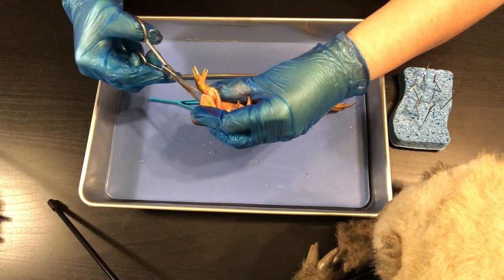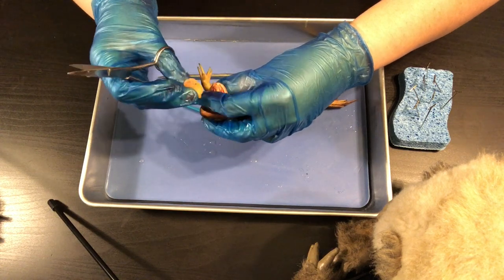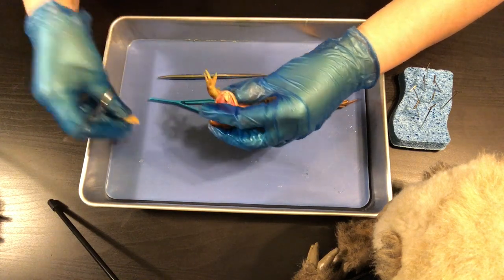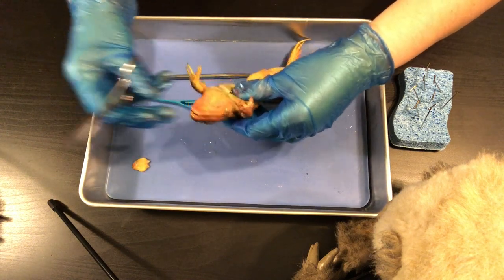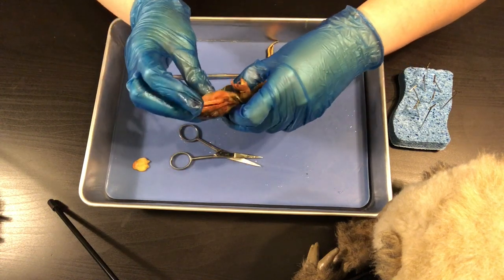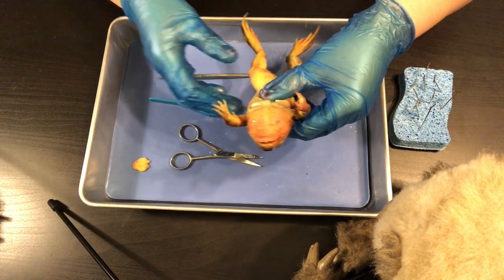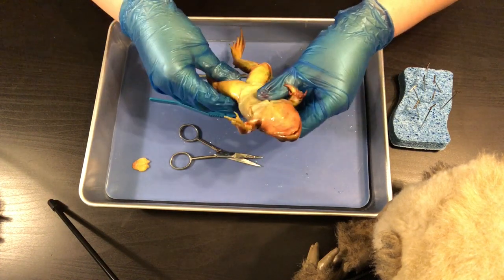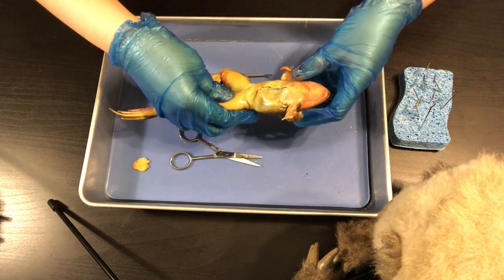I cut the tongue out. I didn't bring an organ sheet with me, but you will have an organ sheet so you can put the tongue on there. Once I've done that — looked at the inside of the mouth, the outside, the feet, and everything — I'm ready to start pinning my frog down.